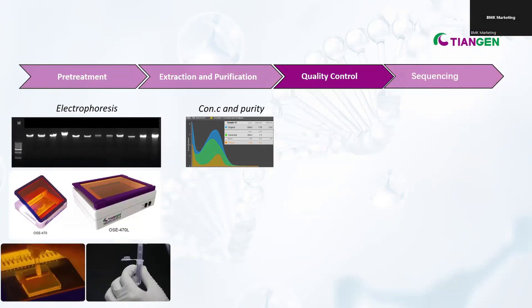The conventional transilluminator uses UV light. Exposure to UV can be dangerous to human skin as well as the samples. To avoid those issues, we instead use blue light, which is safer for humans and the sample.